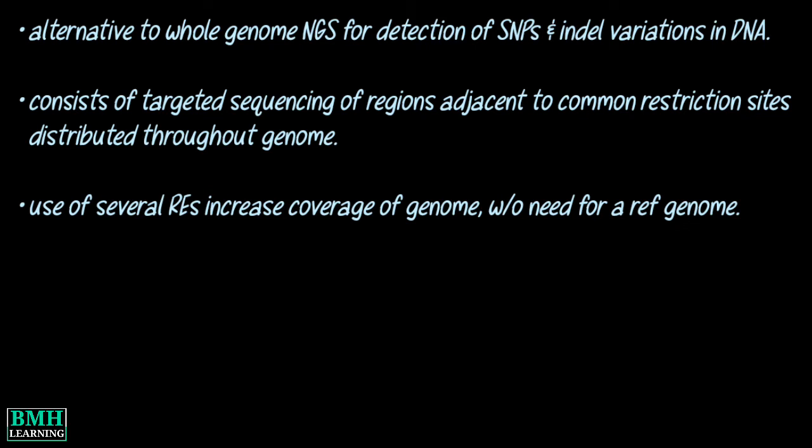This method consists of the targeted sequencing of regions adjacent to common restriction sites distributed throughout the genome. The use of several restriction enzymes will increase the coverage of the genome without the need for a reference genome.